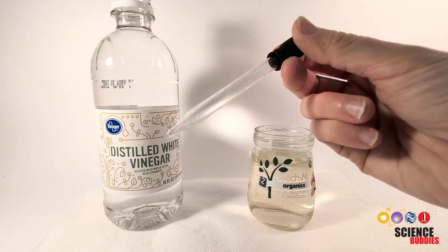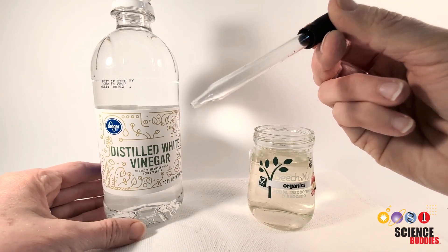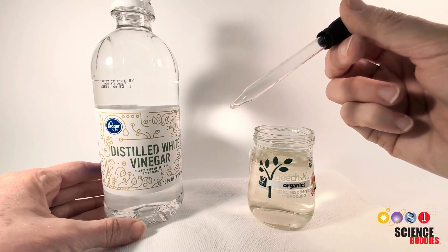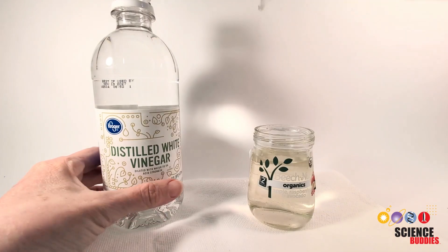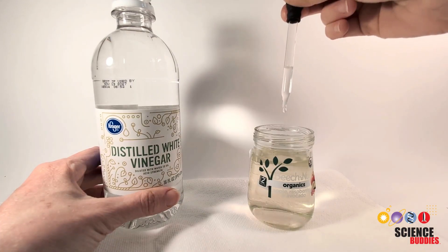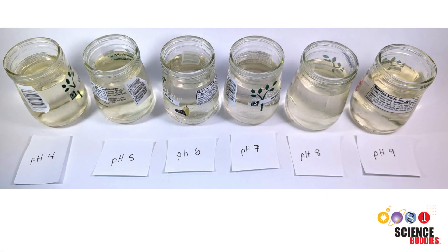Using a sterilized eyedropper that has been sterilized with 70% isopropyl alcohol and then let to air dry, we're going to add just two drops of distilled white vinegar to the pond sample and see how this adjusts the pH. It will probably end up being around six. You'll want to repeat this process with the distilled vinegar to create jars with pH of four, five, and six.